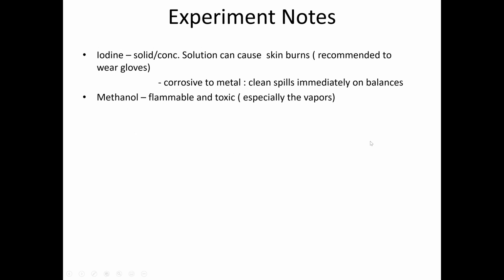So just a few experimental notes. Bear in mind that iodine can cause skin burns. It's also corrosive to metals. So when you weigh out iodine, make sure you use a weighing boat. We'll be using methanol. Methanol is flammable. It's also toxic, especially the vapors.